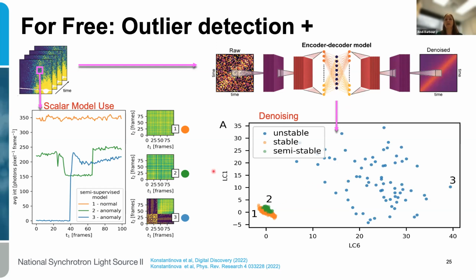And you can see that data set 2 is very close to data set 1. And any human looking at this that knows something about XPCS would say, well, okay, they're both static, so nothing is different about these 2 measurements. Let's just move on to the next temperature, especially if this data set were expensive in time to collect, like if it took half an hour.